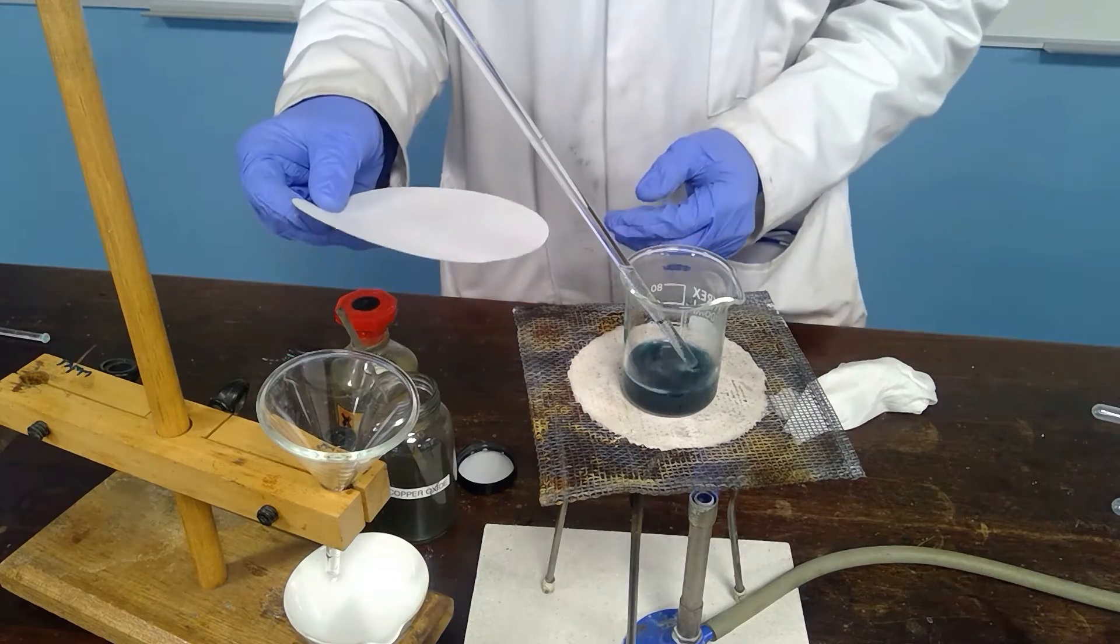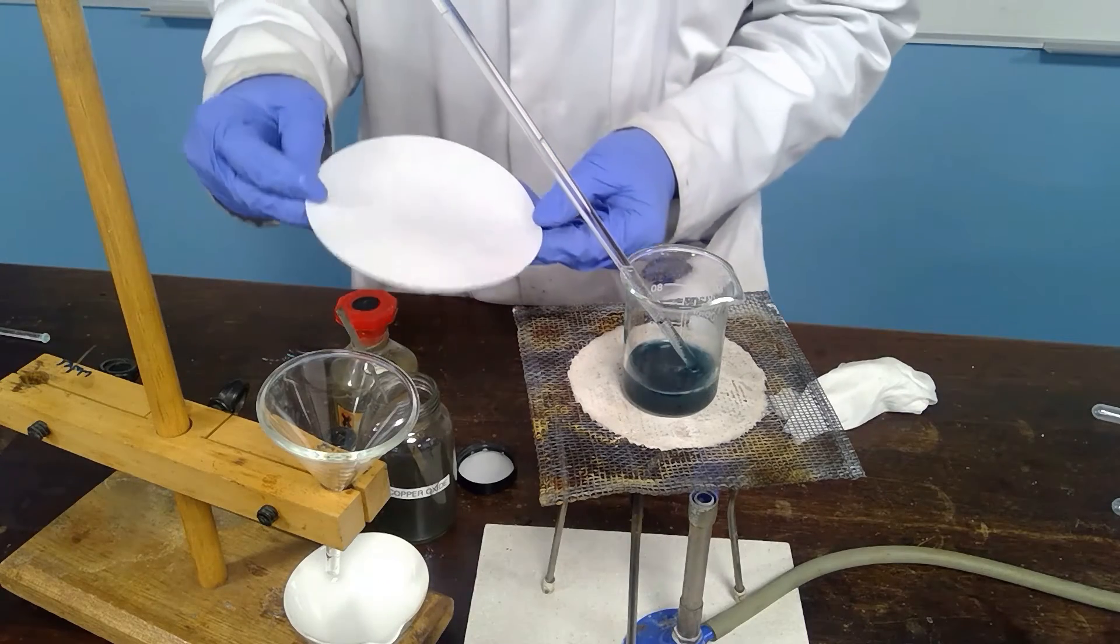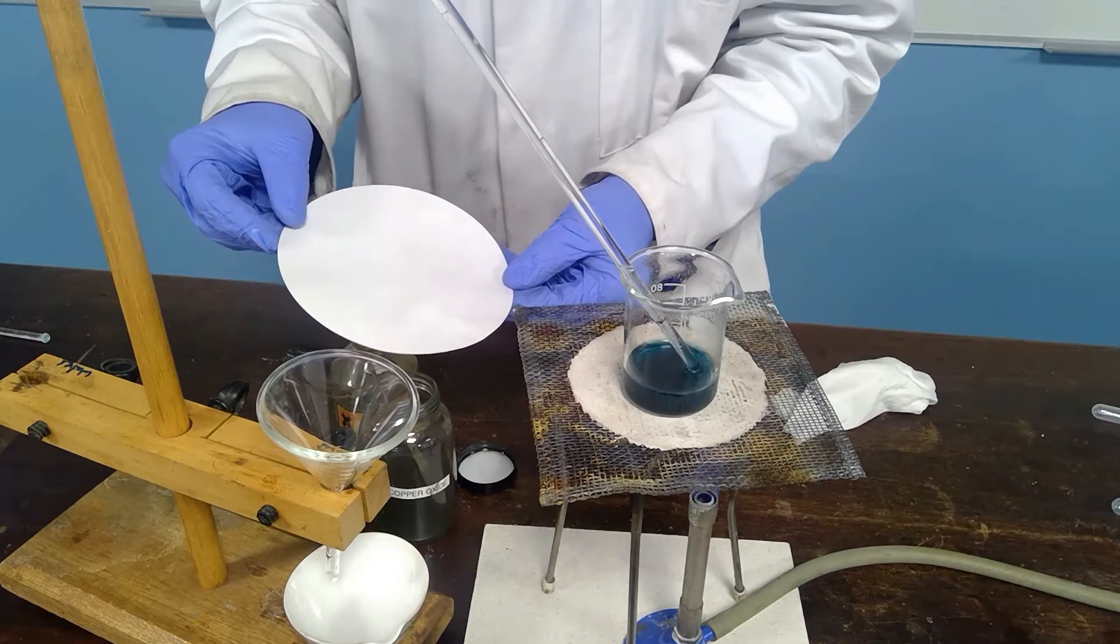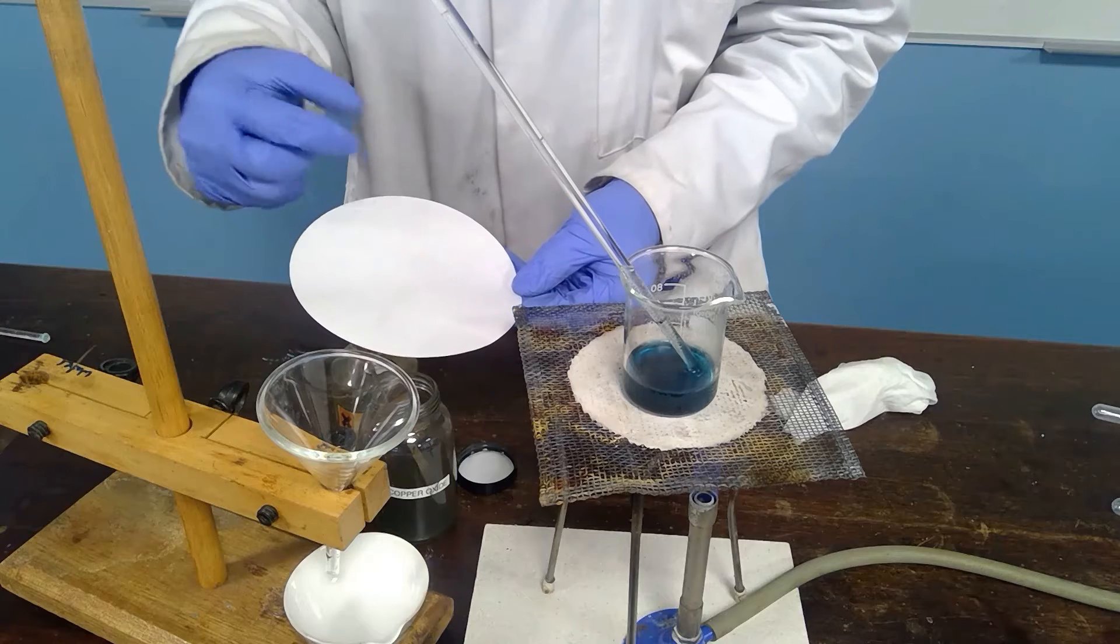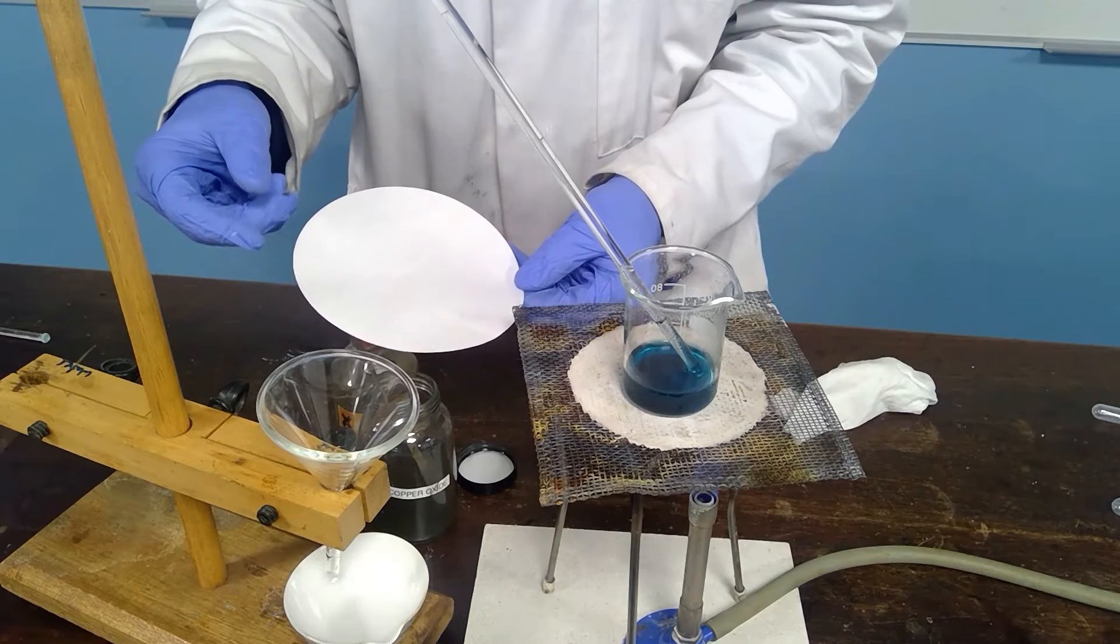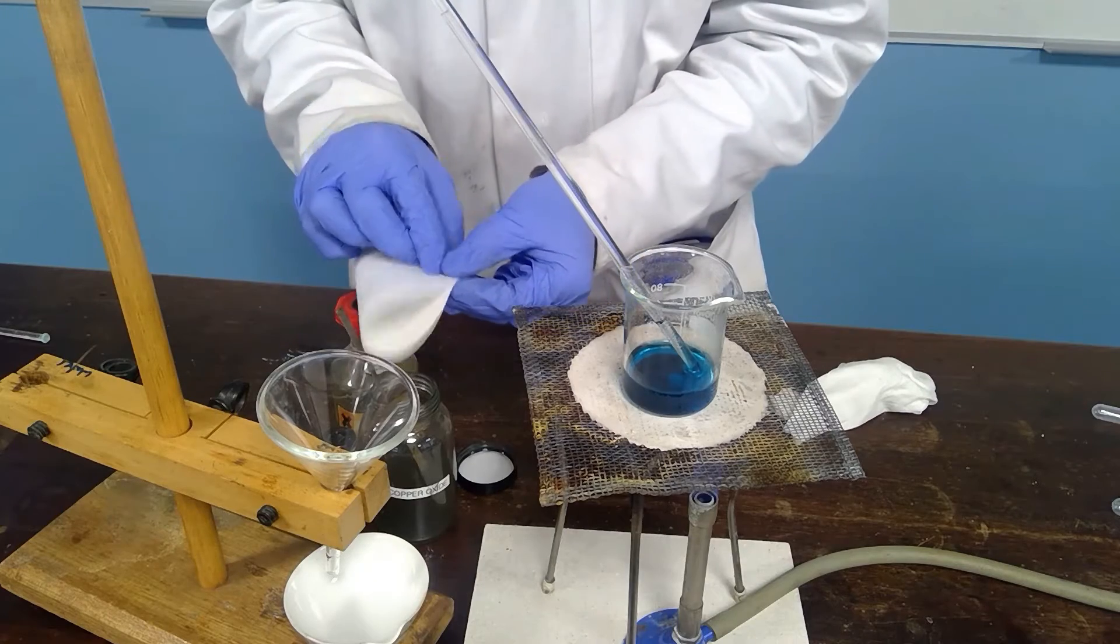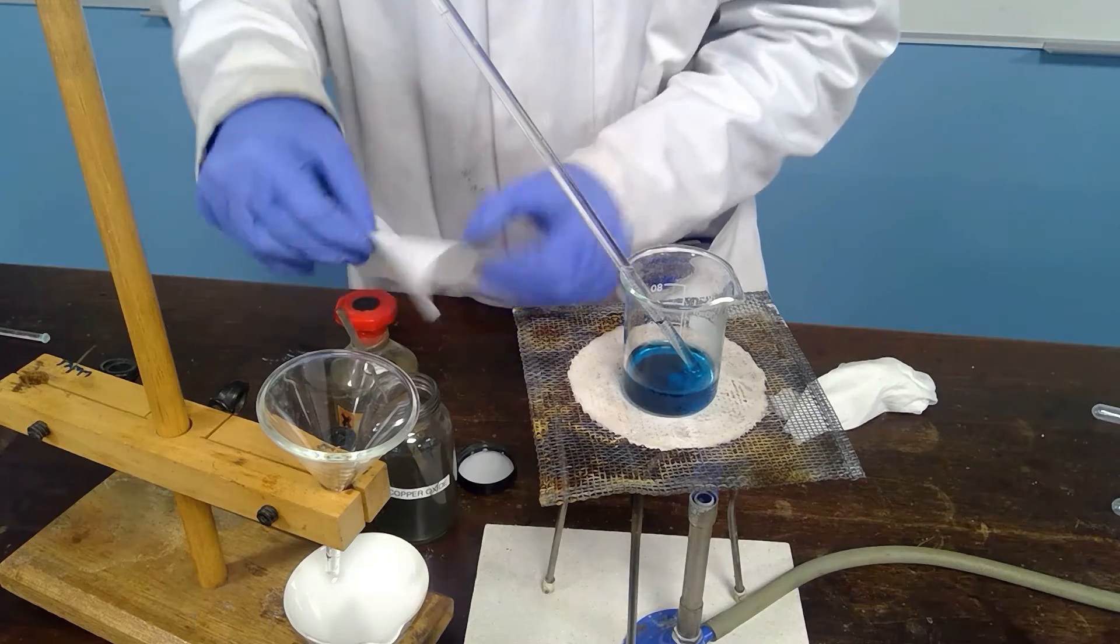We're then going to filter. We're going to use fluted filter paper. If we were to set this paper up in the traditional way of just folding twice and opening up with three layers and one layer it is not as efficient as if we had only one layer. So to achieve this we make fluted filter paper.